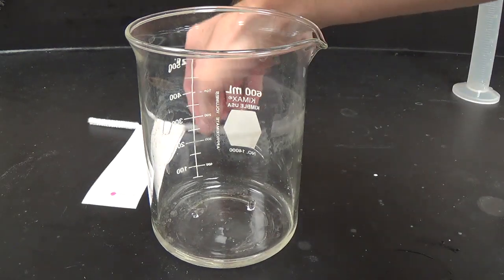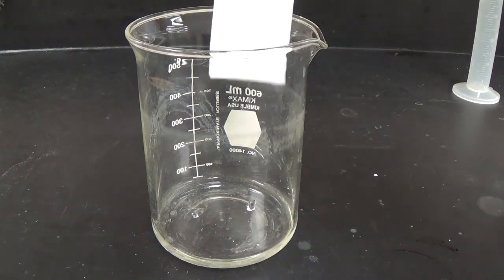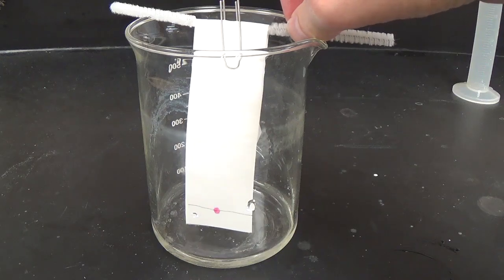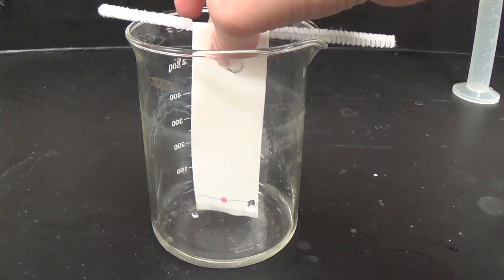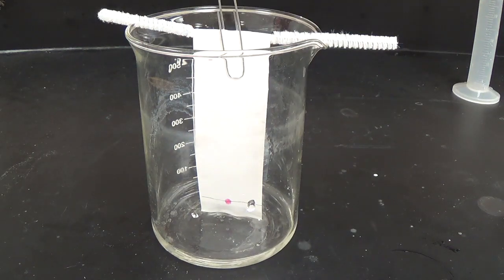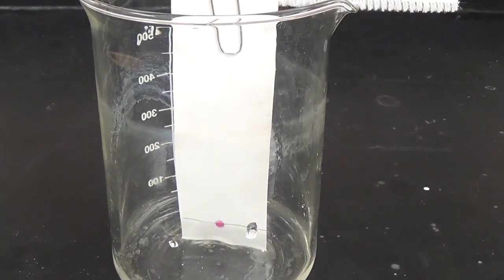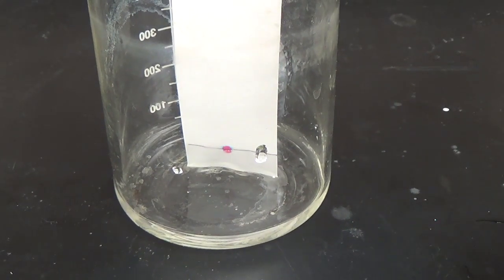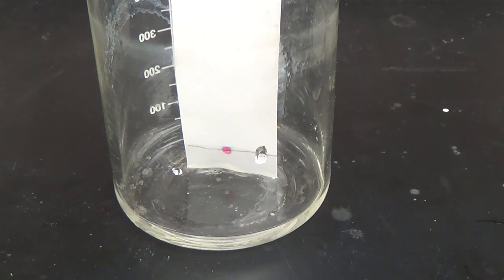I have my stationary phase right here as the paper, and I'm going to lower the paper in slowly to where it dips into the water just barely. That's what I want. I want it to make contact with the water. I do not want the dot submerged in the water. If the dot is submerged in the water, then it will wash away and you won't get the results that you need to get. And we're actually going to sit here and watch it develop.